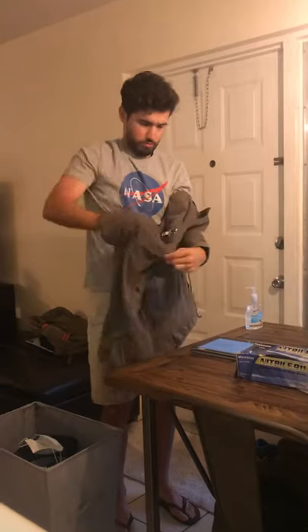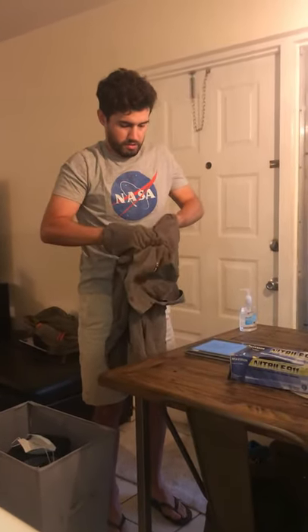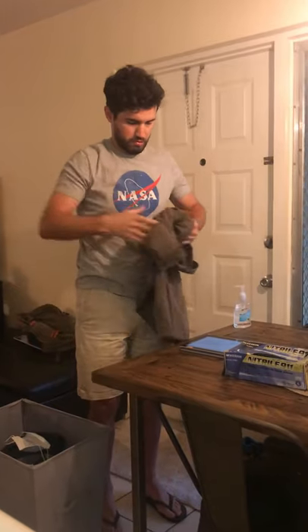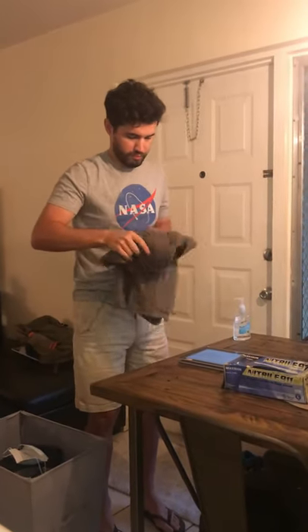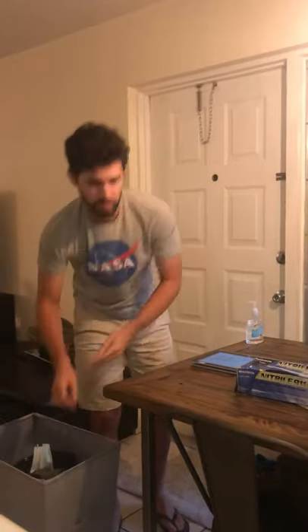Next we're going to take off our gown. We're going to pull from the neck and roll inward like this, and dispose of it in the appropriate container.